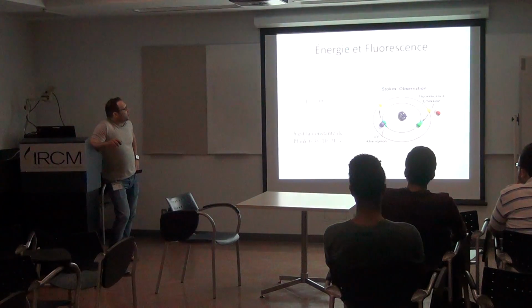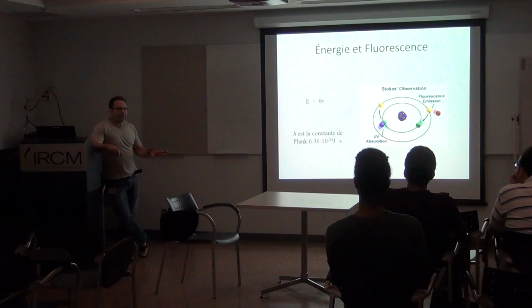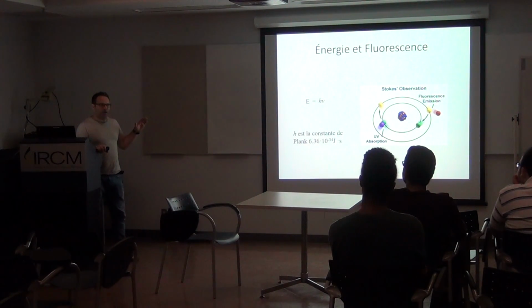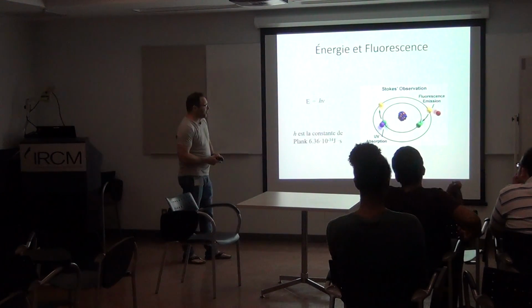Fluorescence is a concept that is used all the time in microscopy nowadays, mainly since they discovered the green fluorescent protein from the jellyfish. This event was really something that made microscopy techniques widely used and gave nice images. So it's really important to understand fluorescence.